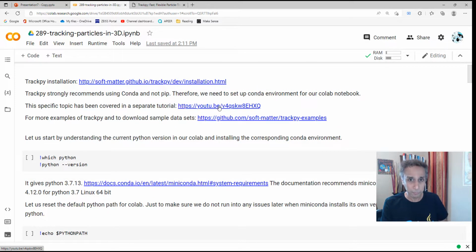Watch this video that I've done maybe more than a couple of months ago on the topic of how to install Conda on your Colab. So I'm not going to go through that in very much detail.